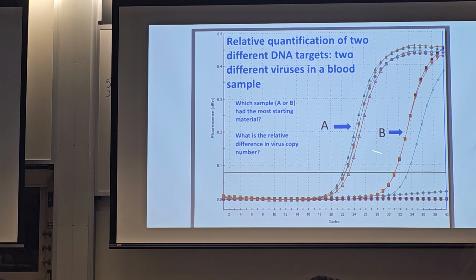So that's just an example, and it shows you the basics of the calculation. Now the instrument actually measures where things are crossing the threshold. So I said 22 here, but the instrument might come up with 22.2, and it'll do the same thing over here, and then it does the math for you and spits out the answer. The instrument is going to do it for us.